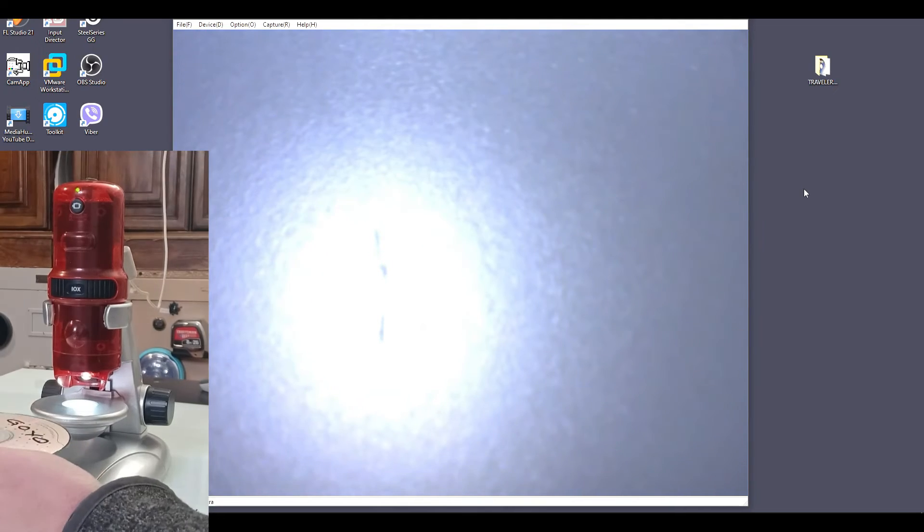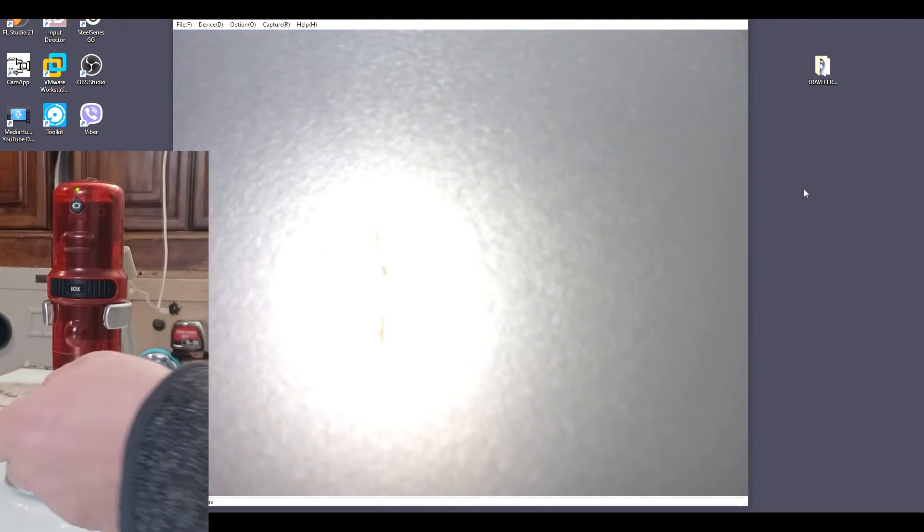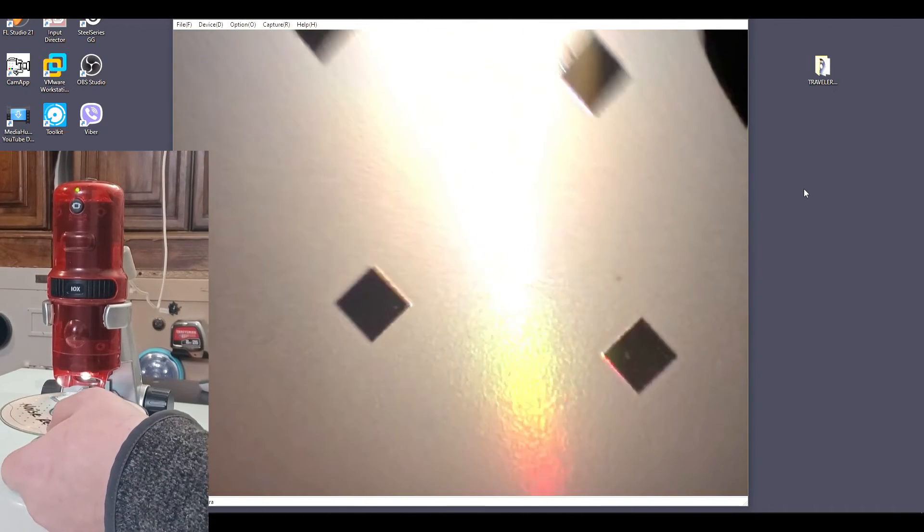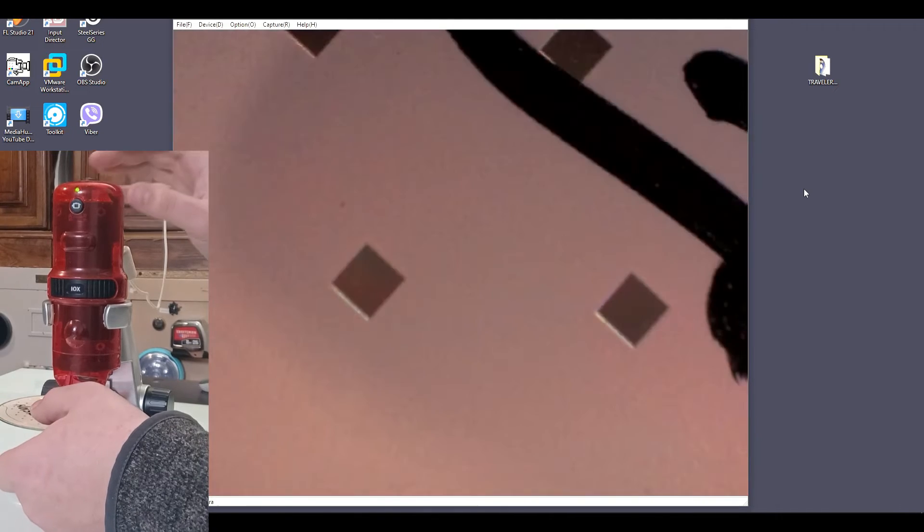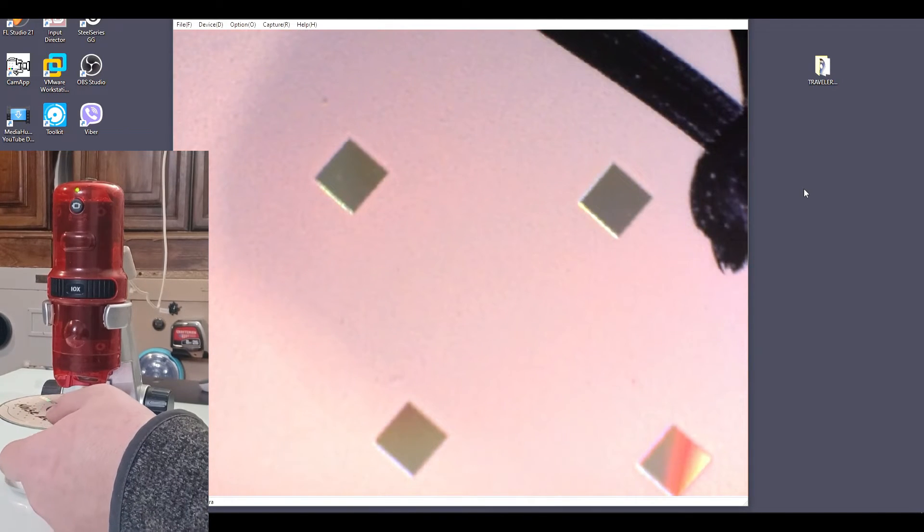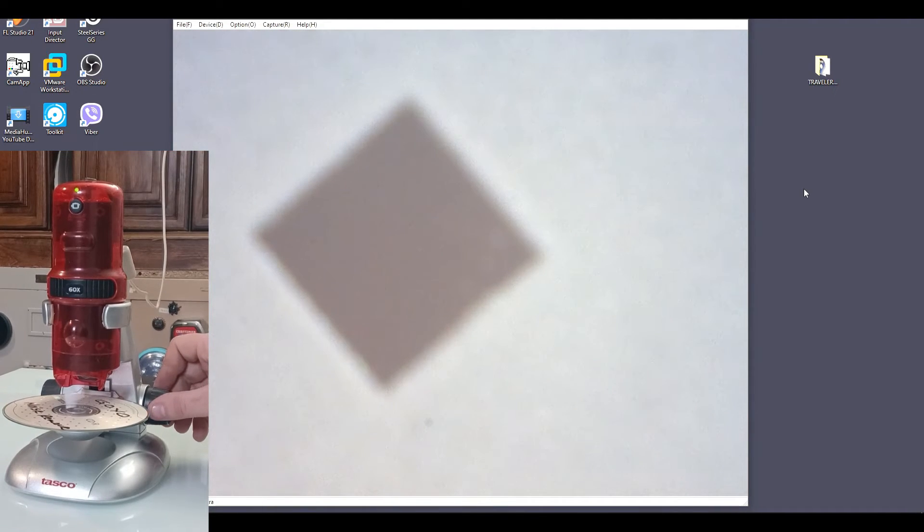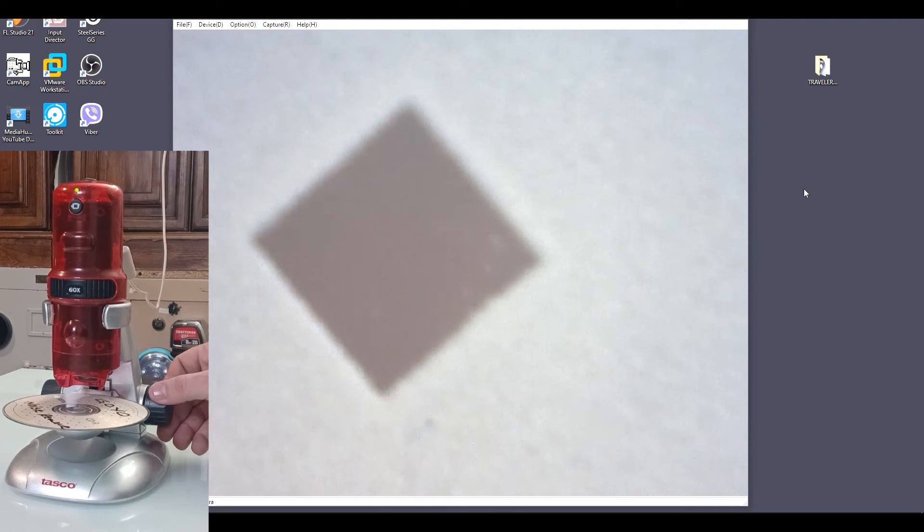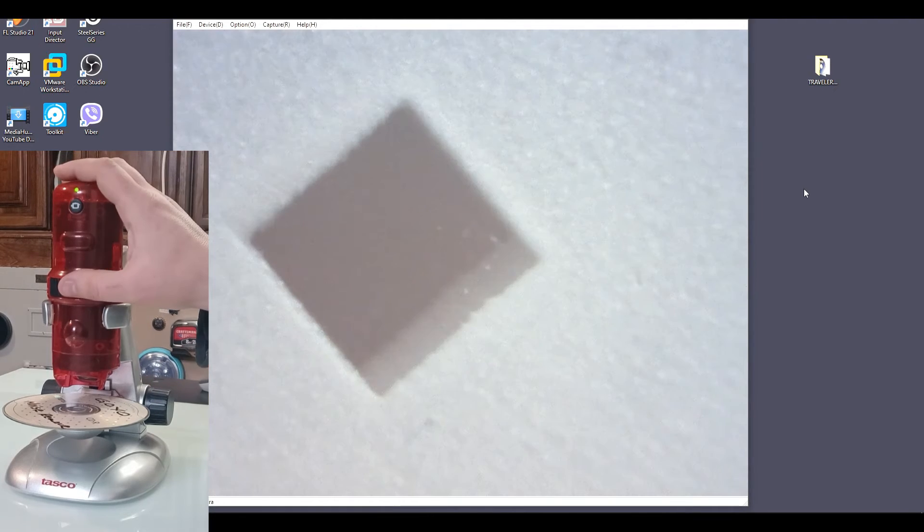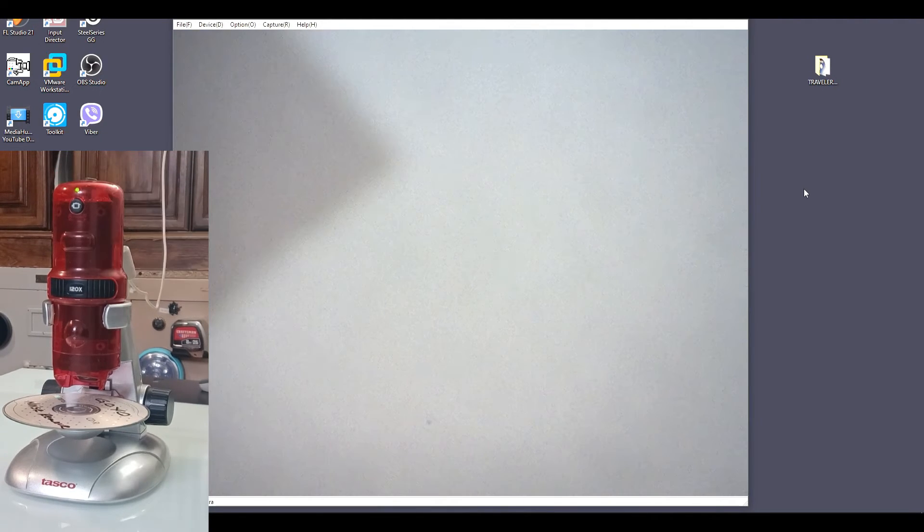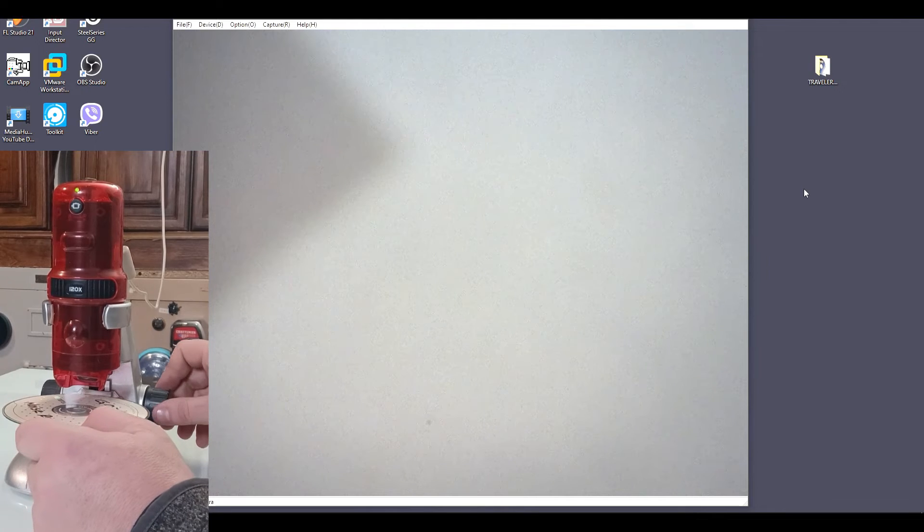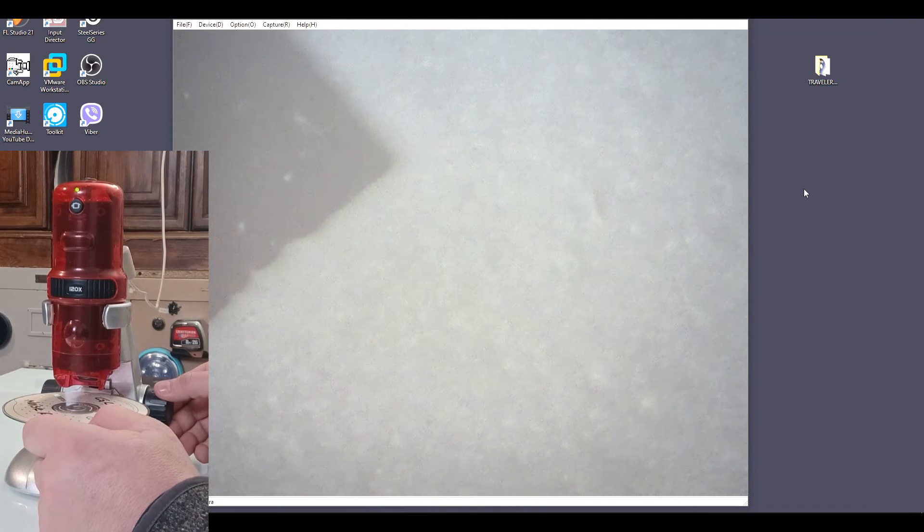In my opinion, it works really good. Look at this CD, for example, these tiny dots here. Let me put them under this microscope and how they look. But I probably have to turn off the light because there's too much light here already. And this is that same cube under this microscope with the light off. Let me zoom in a little bit more what we can see from it. This is a corner of that cube, but we'll try to clarify it.